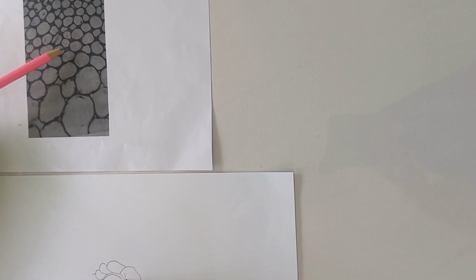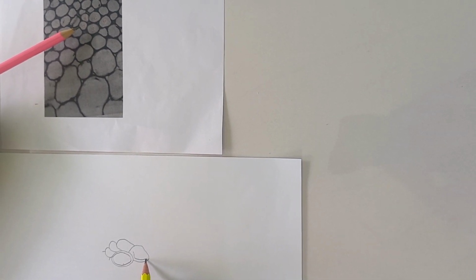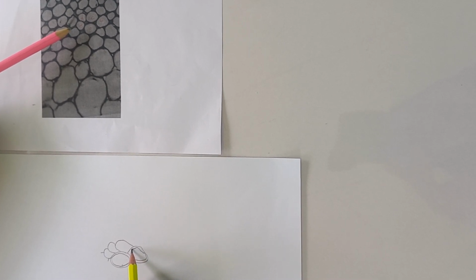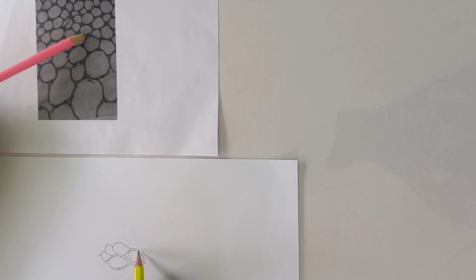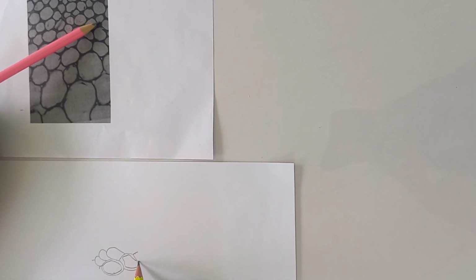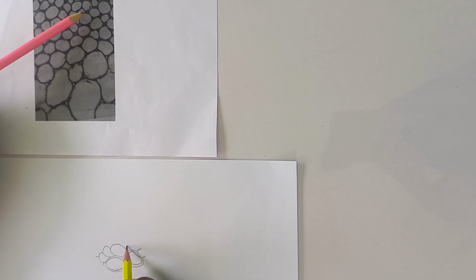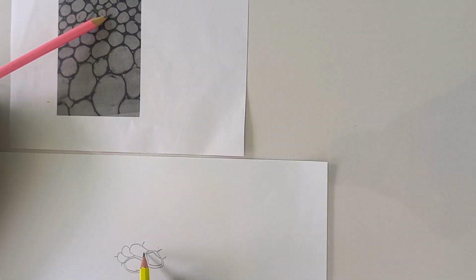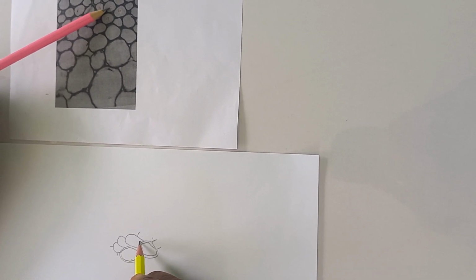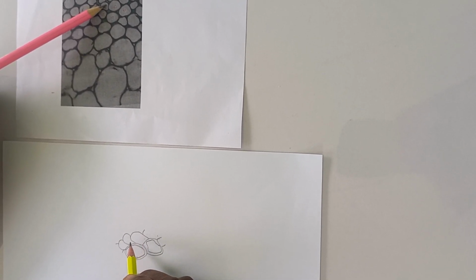So we have thick, the rest of them is thin. And there's a cell close here, and there's a thick wall, a thick cell here. This is our C. The wall between the two is not too thick. There's a region here.